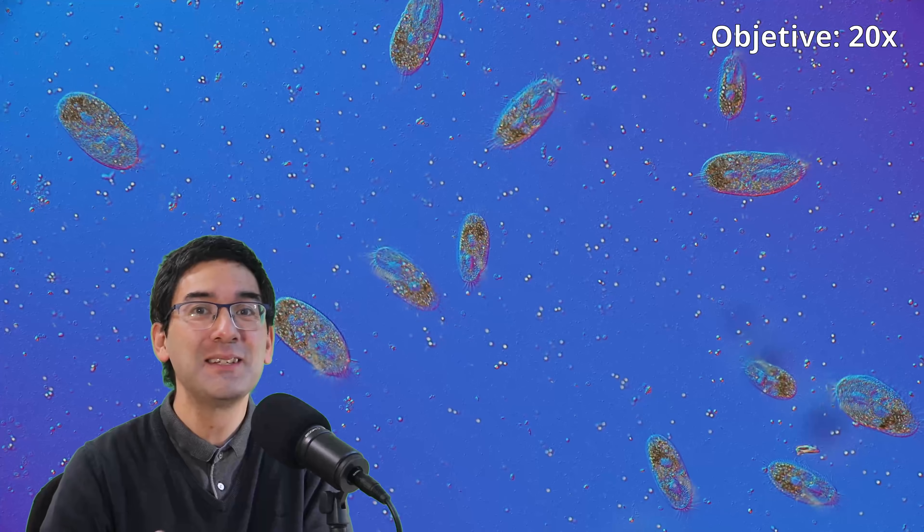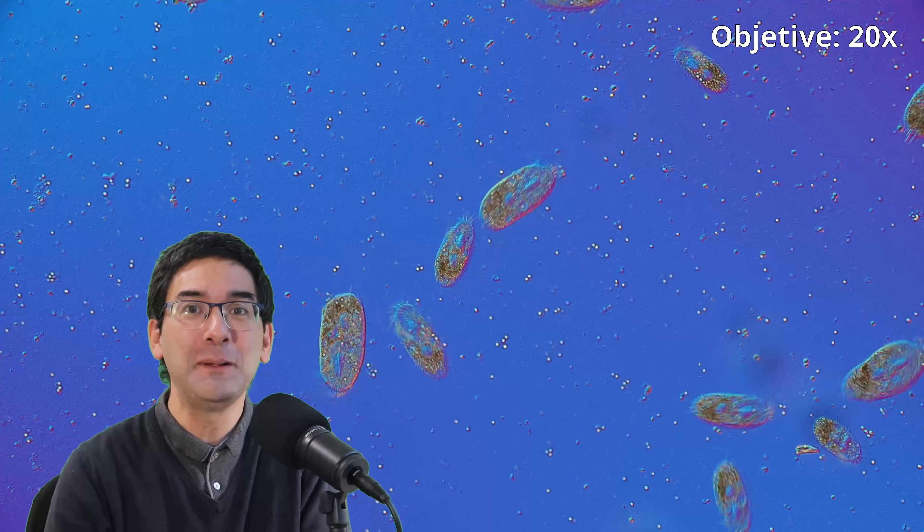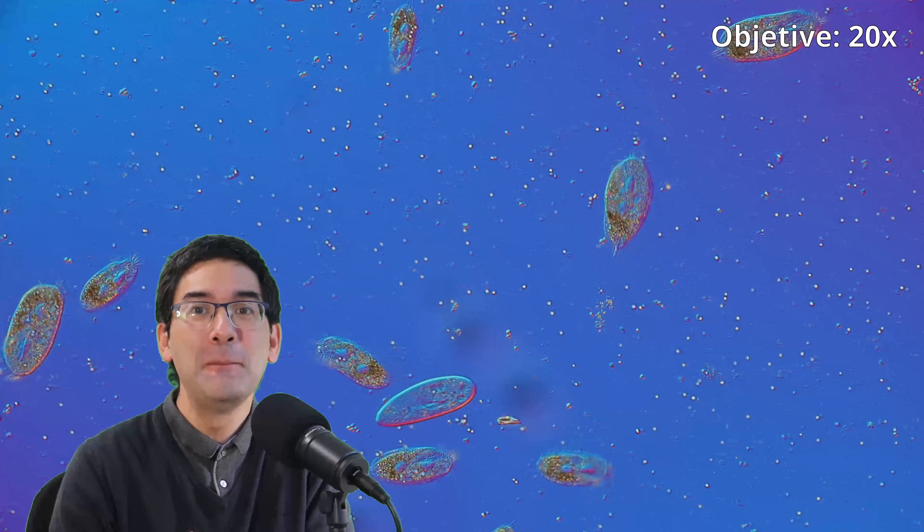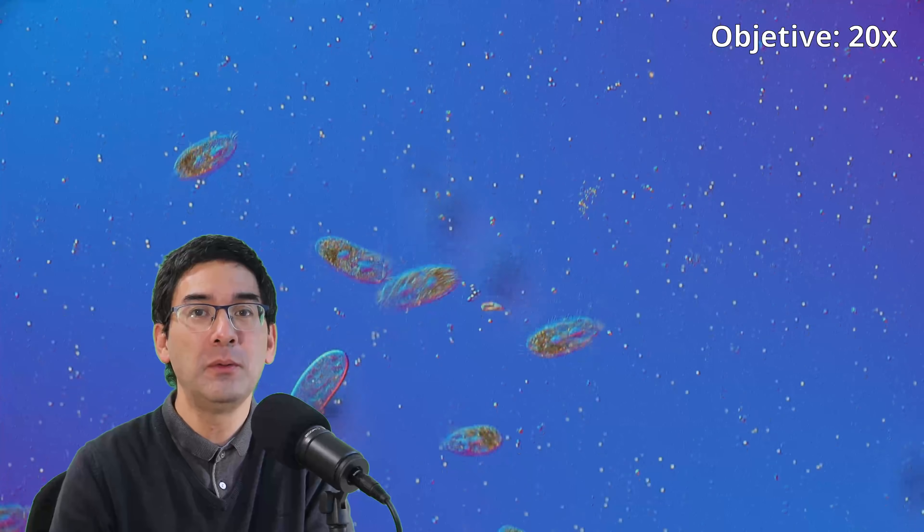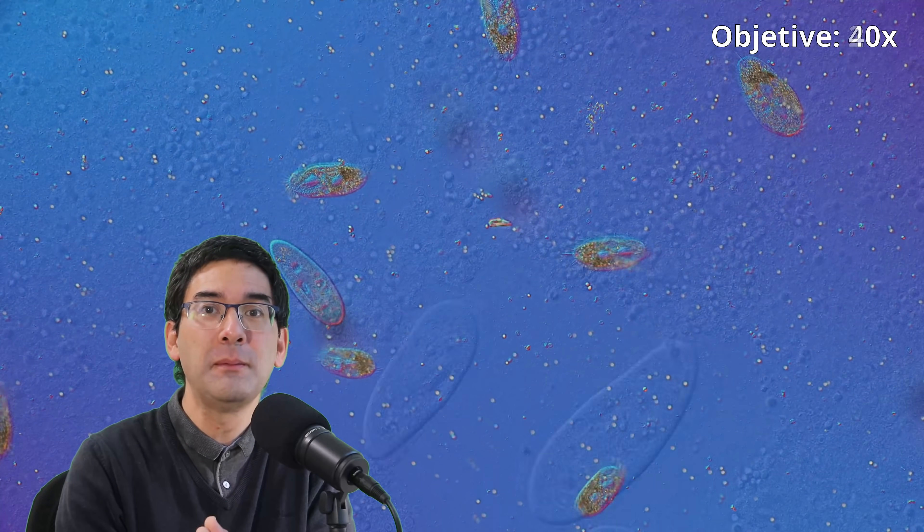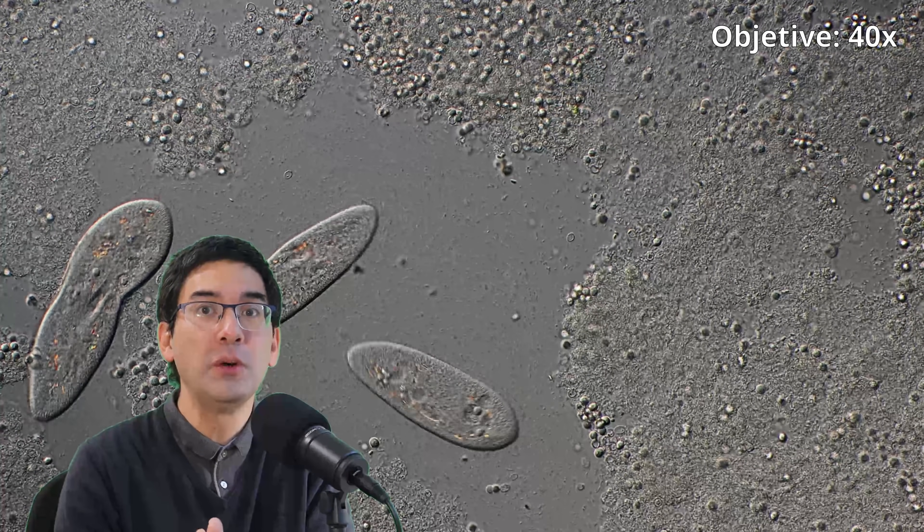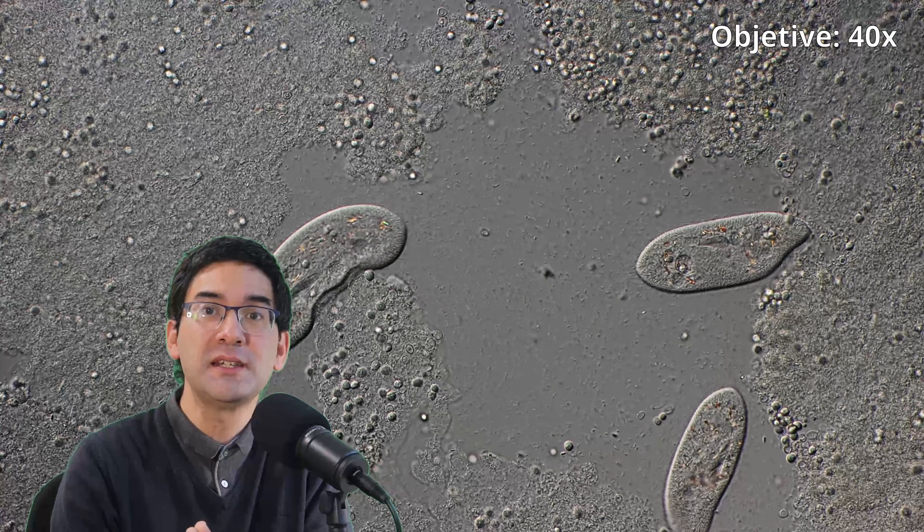Here we see those ciliates still swimming around more or less happily. The buffer solution has not reached them yet. But just after a minute or so, when the buffer solution is drawn beneath the microscope's cover glass, all of a sudden you're going to see that the cells start to lyse.